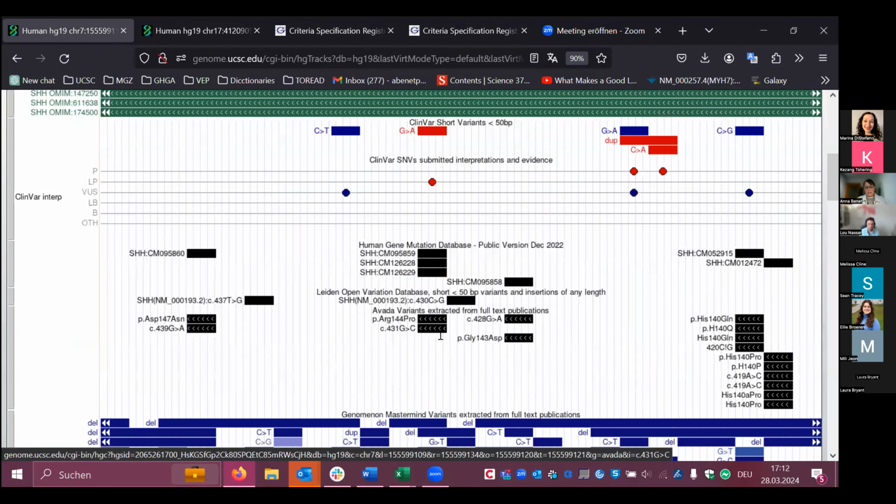In the mouse over, you can see the data from the Excel table, like the assigned code and the code weight. If you click, for example, on this variant, it opens the variant information from the table with all the other fields included in the table. The other fields are not shown in the mouse over, but you can find them here.